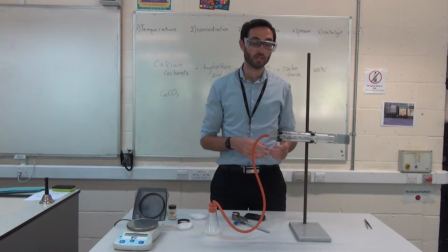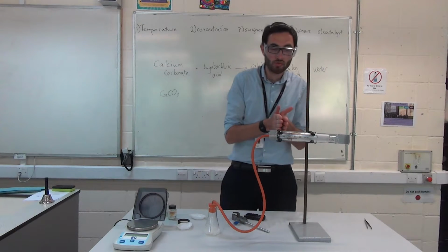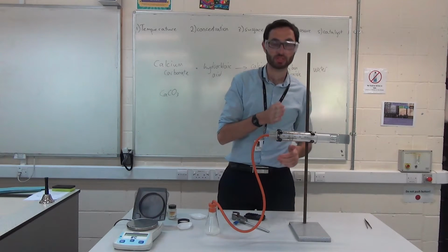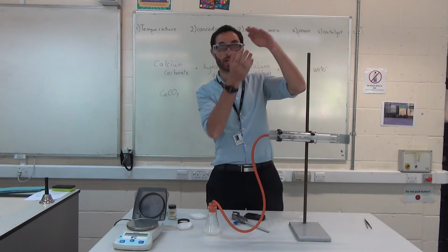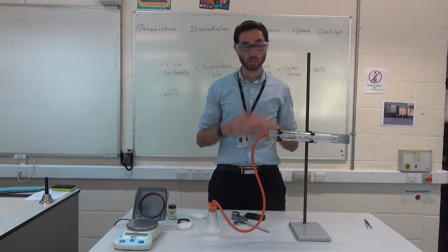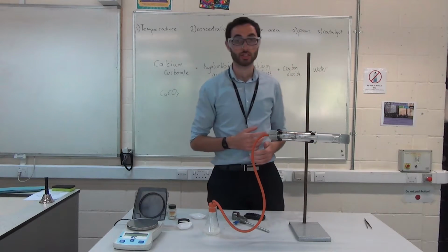Now the reason why the gas syringe is useful for this is because there's not bubbles, it's going up really gradually. So I know when I pause it that I'm getting a really precise reading, and I know that I'm not reading it and there are more bubbles still to come. So it just can give me a better reading. Doesn't always, but it can give me a better reading if your experimental technique is good.